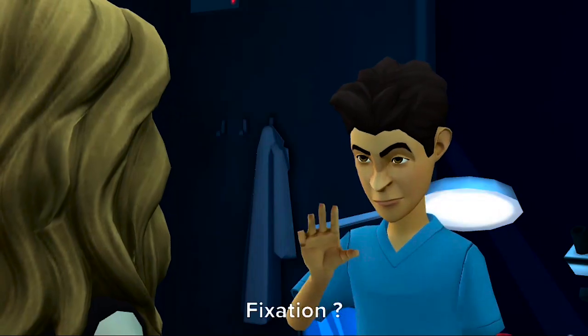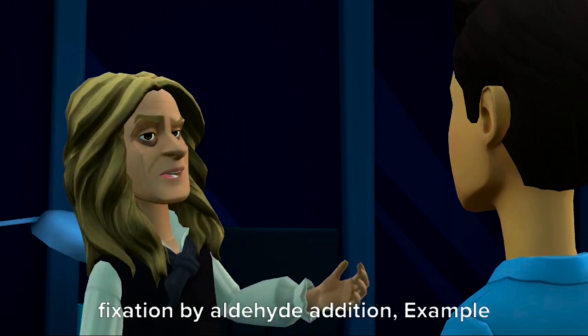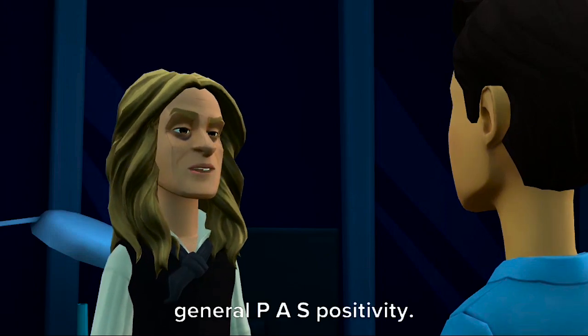Fixation? Fixation is not critical; however, fixation by aldehyde addition — for example, glutaraldehyde — will produce non-specific general P.A.S. positivity.